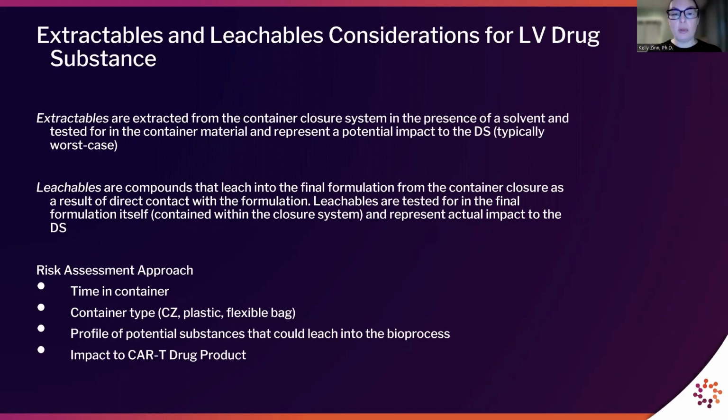A risk assessment approach can be taken to evaluate viral vector leachables, their impact to the vector and their impact to the overall CAR-T product by considering the time the vector spends in the container, and evaluating the container type. If it's a CZ vial, plastic bottle, or flexible weldable bag, they'll have different inherent leachable risks.